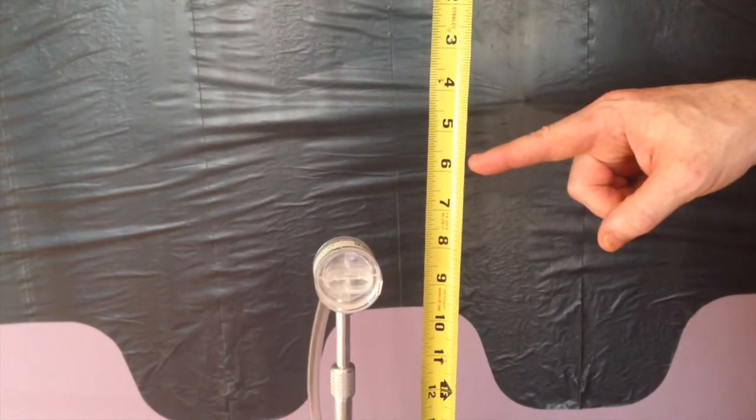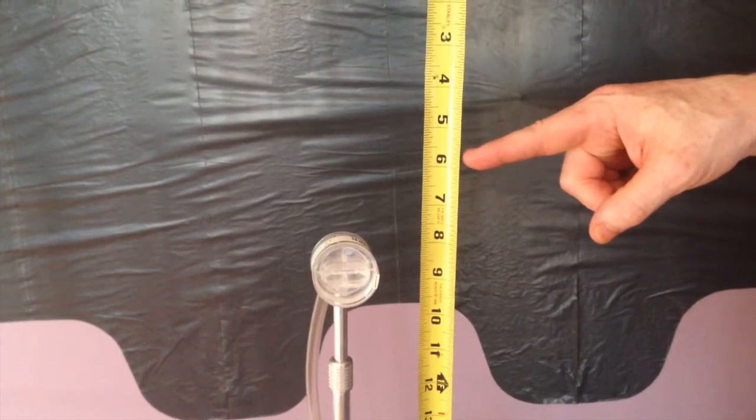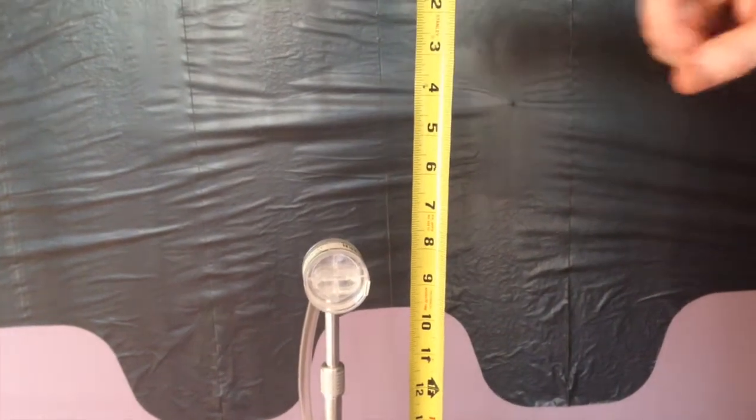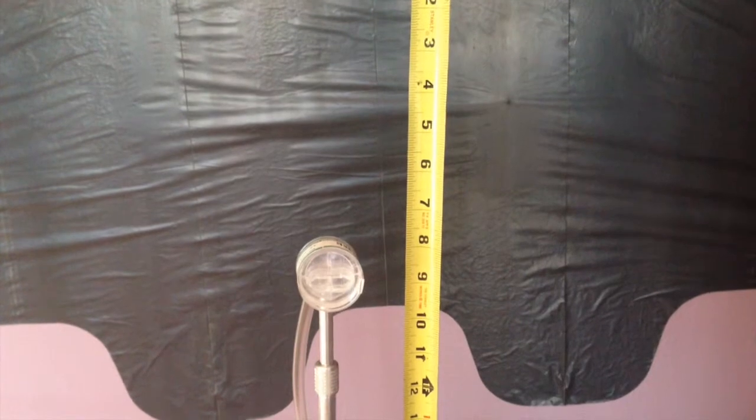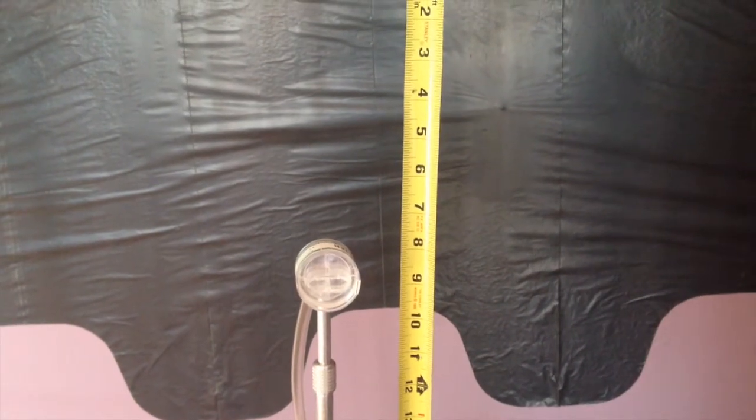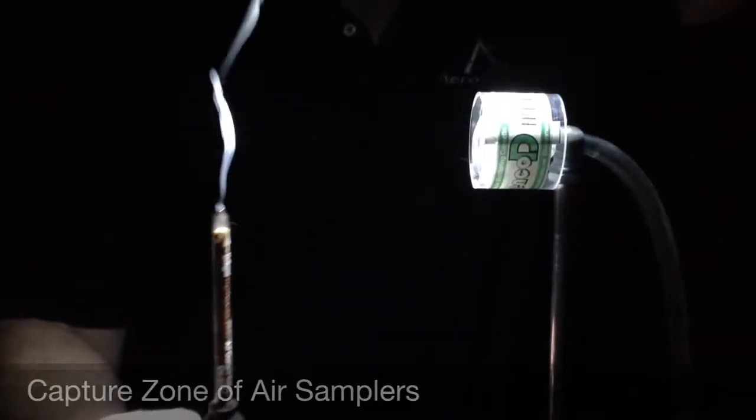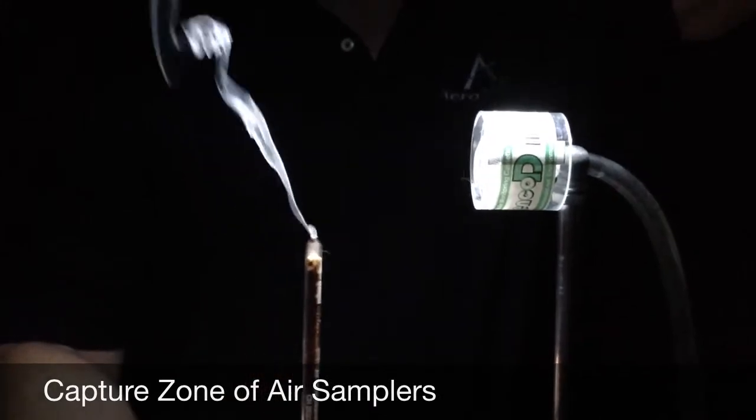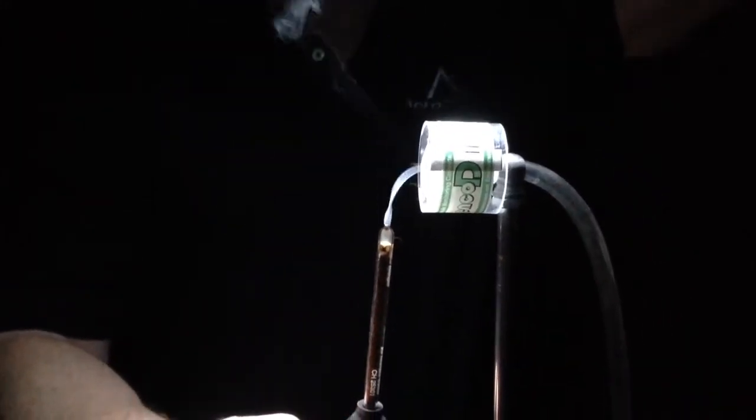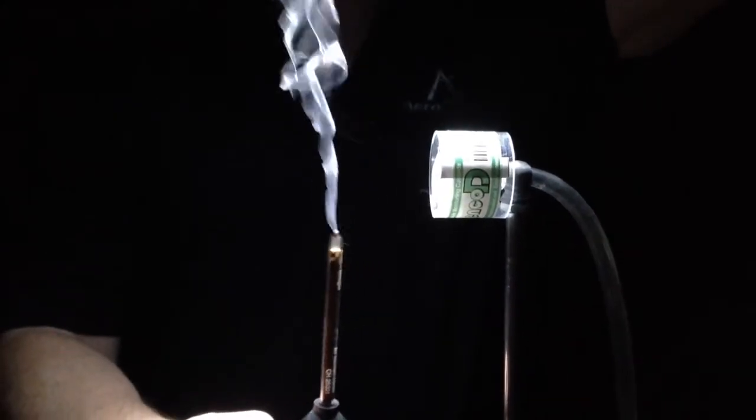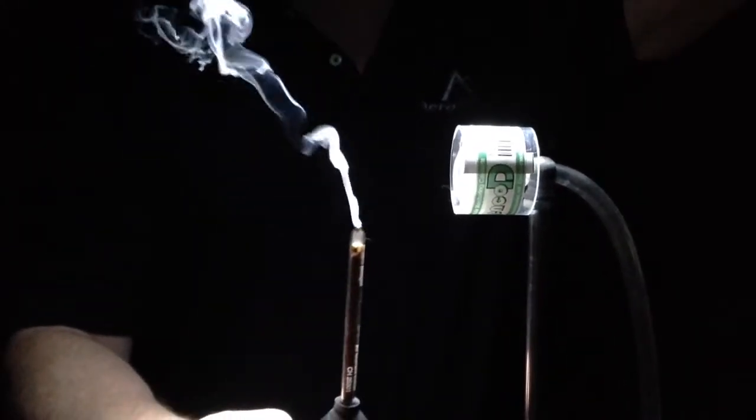This smoke test shows a capture zone is much smaller than the 75,000 cubic centimeters normally reported by labs when converting the raw count to spores per cubic meter. Count results given as spores per cubic meter can't be taken seriously given the variability. There may be more or less spores per cubic meter. If you take enough samples in a cubic meter of airspace, one spore trap air sample can't possibly quantify that issue.